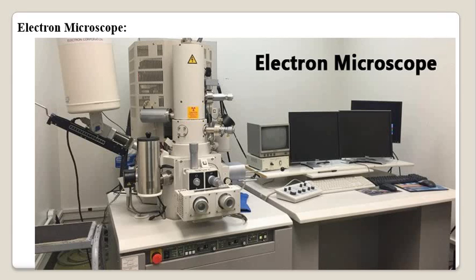The resolving power of the microscope is limited by the wavelength of the illumination and formation of the image. So in short, this electron microscope gives us a highly magnified image of the biological material.